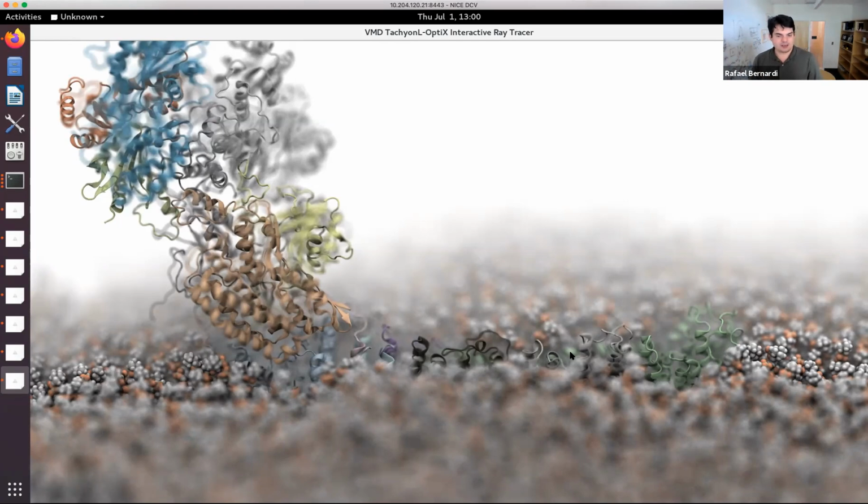And there you see here, it's looking nice, right? So it's already looking a lot different than before. So people are asking questions here.